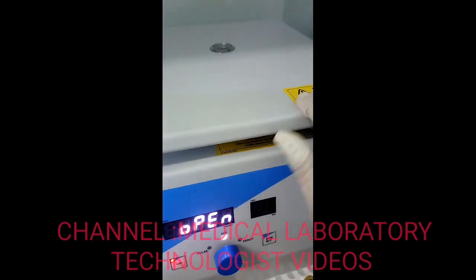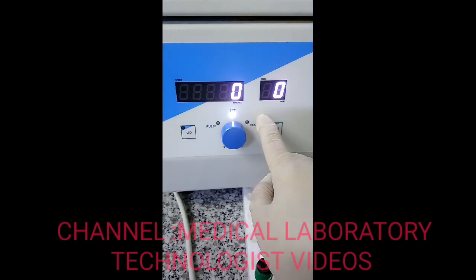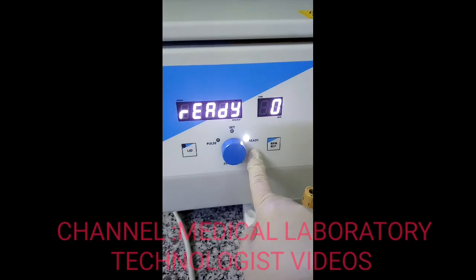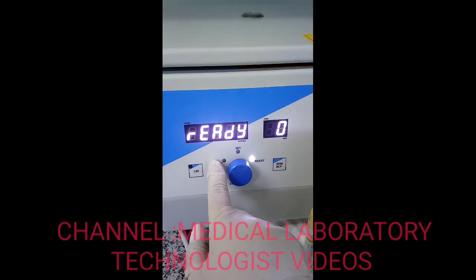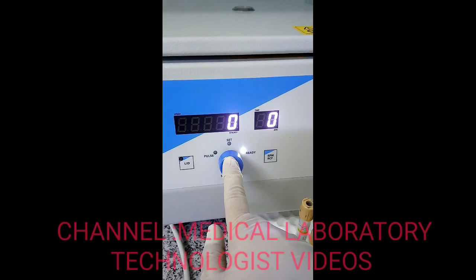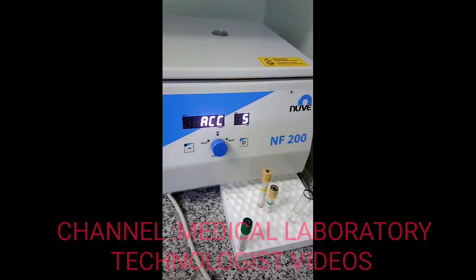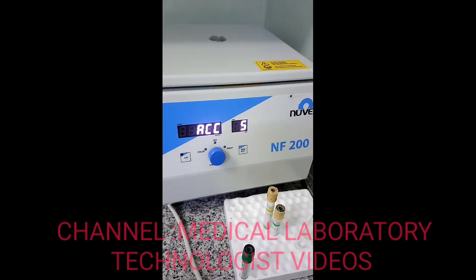Now I will close the lid. When I close it, the display will show zero. If you wait two to three seconds, the light will automatically come to the ready position. Once it shows ready, just press the start button once and it will run for five minutes.